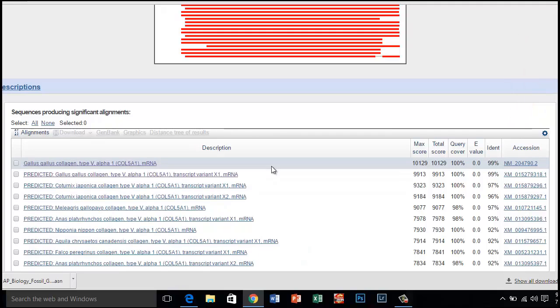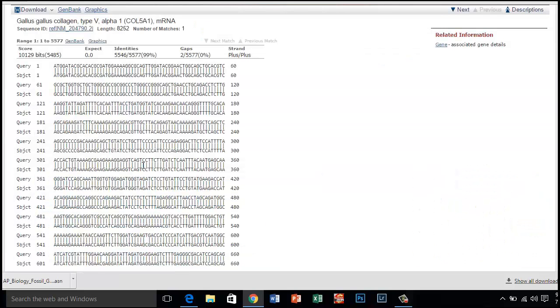If you click on a particular species listed, you will get a full report that includes the species classification scheme, the research journal in which the gene was first reported, and the sequence of bases that appear to align with your gene of interest.